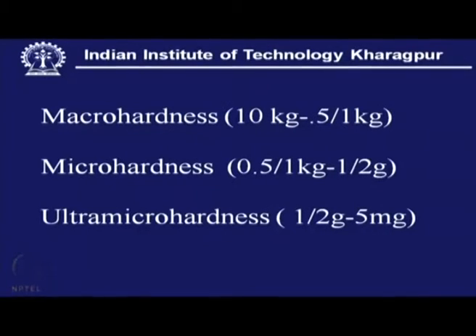Now, here what we find is that hardness is actually a technique of measurement, and these are already well established techniques, what we are showing here.